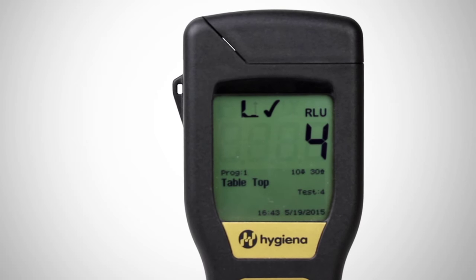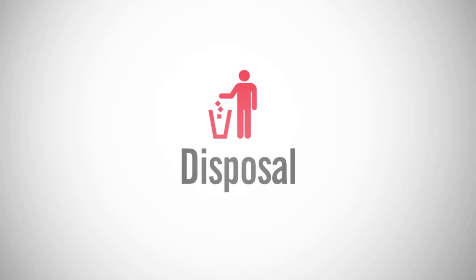Results will be displayed in 15 seconds. Find more information about setting appropriate RLU limits for your facility at Hygiena.com or by watching the setting pass fail RLU video on our YouTube channel. Since UltraSnap is made of 100% recyclable plastic, used devices may be discarded in the recycle bin.